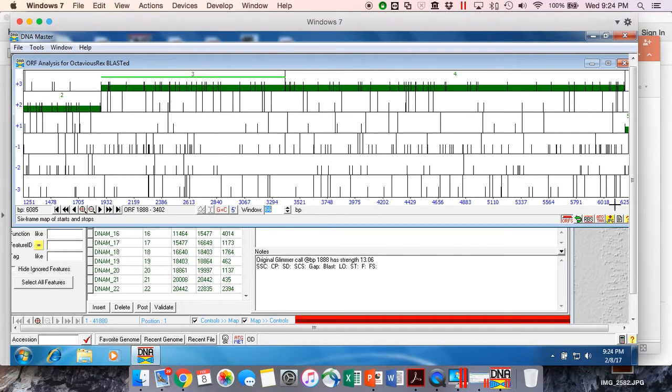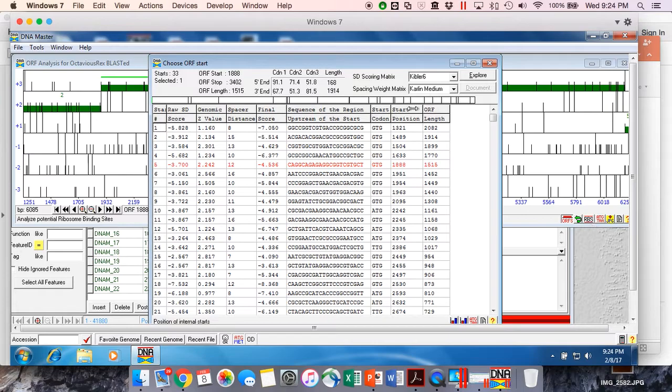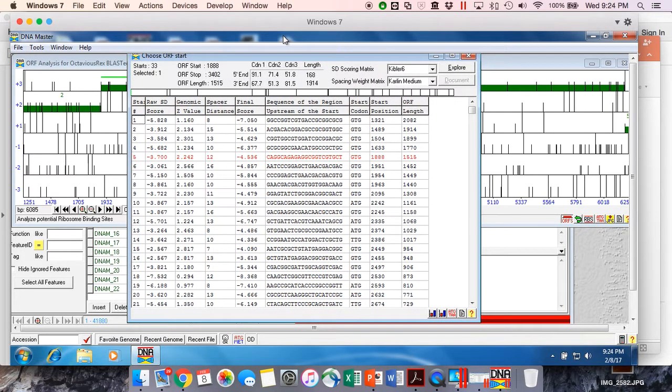So we're going to click on this button here that says RBS. And you're going to see a chart that looks like this. And right away, yes, it looks very confusing, very busy. But what this is showing is some values and some information here.